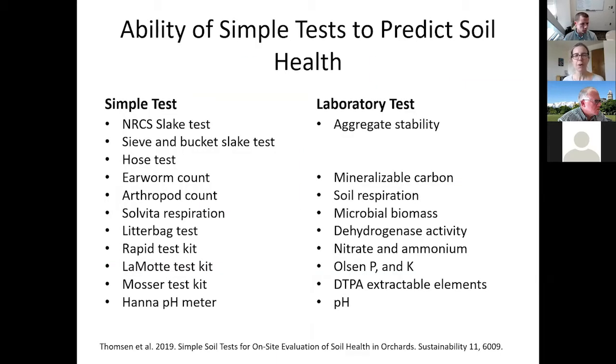And so my student and I, we got some dollars to start to look at this. And she, like I said, we ordered the NRCS soil testing kit. We ordered a bunch, we basically went shopping and got whatever we could get and laid them all out and then kind of ranked them. She tried them out: ease of use, cost, that kind of thing, time.